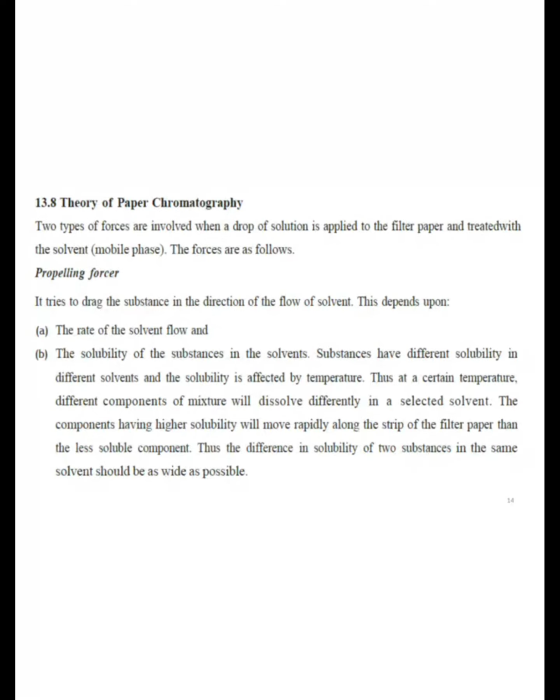This is the second type of chromatography, that is known as paper chromatography. And here two types of force are involved. In paper chromatography, a drop of a solution is applied and it moves upwards, and one more is the downwards. We are going to study this in paper chromatography.